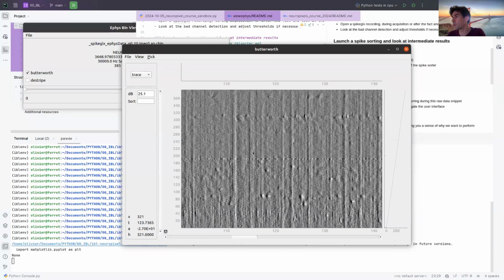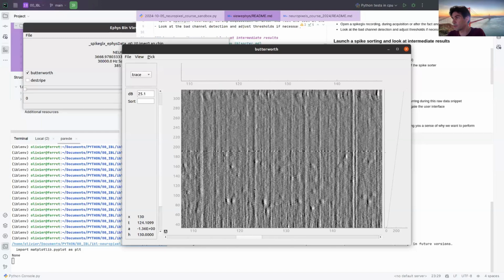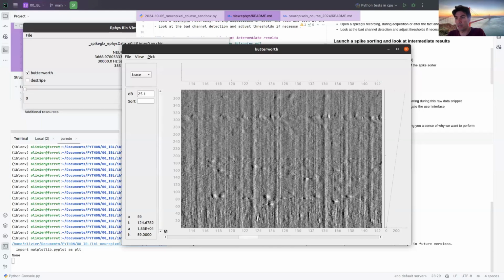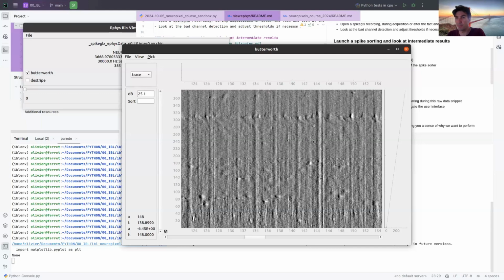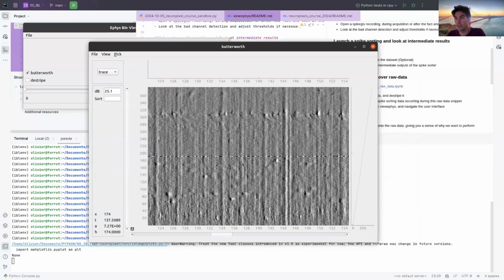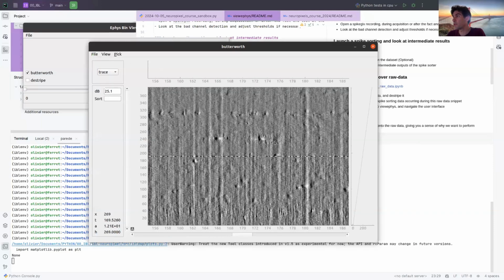The idea was to take control of the GUI a bit, trying to pan left and right, and to zoom. If you zoom, it's with the right button. It's a bit like Pinpoint, in the sense that video game experience can be helpful in order to navigate this properly. After, the idea was to set up the display.